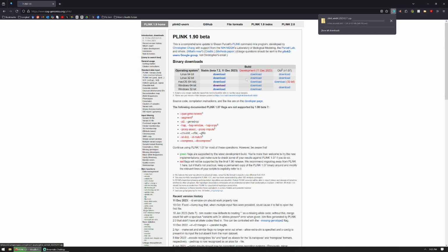Only older Windows is going to run 32-bit, and if you were running a 32-bit operating system in this day and age, you would know it. So just go ahead and choose the 64-bit, and that downloads wherever your computer tends to choose to download things. I've set mine for this video to download to the desktop. So we are now done with our internet browser.